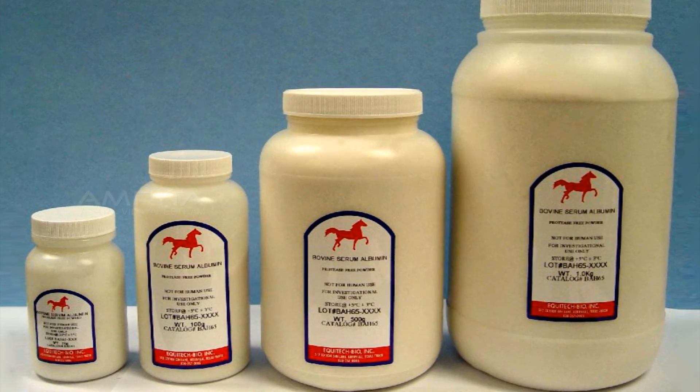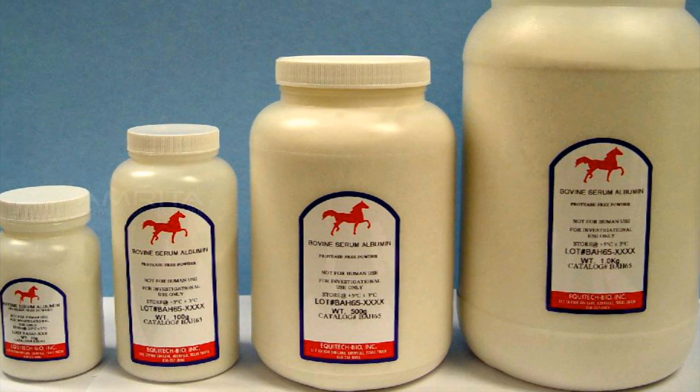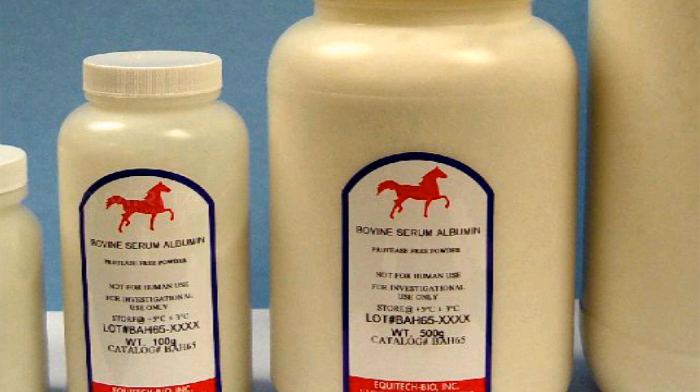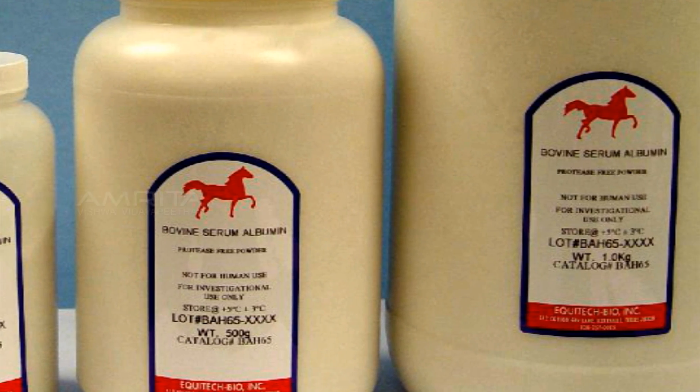Most protein estimation techniques use bovine serum albumin as a standard protein because of its easy availability and low cost with improved purity.